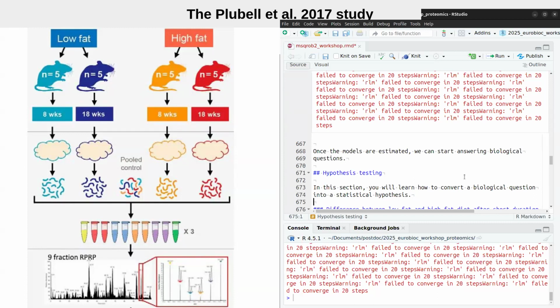Okay. Yes, that's exactly right, because we aggregate it at the protein group level. This is why it's important. If you have a protein group that is empty, then you would consider all the peptides that have not been identified to come from the same protein. If I have many different proteins, this is all fake. And this is why I was also asking.